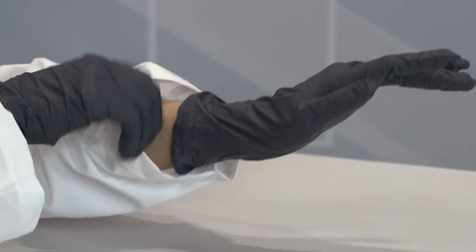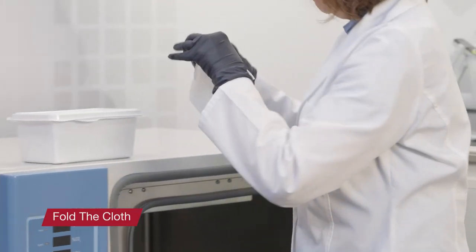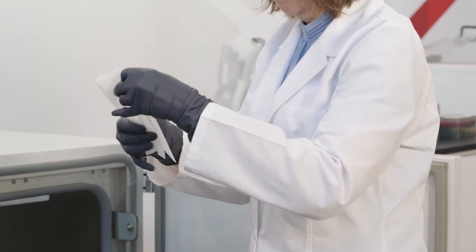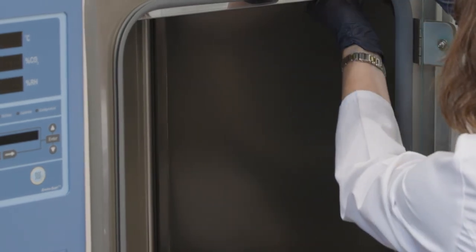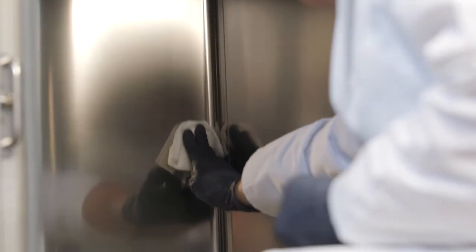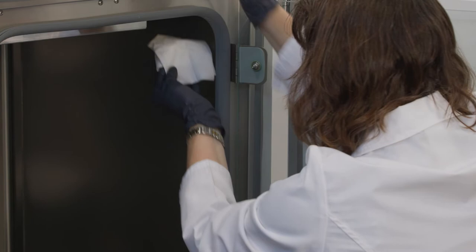Gloves and eye protection should always be worn when handling chemical disinfectants. In midair, fold the cloth in half, then fold in half again so it is folded in quarters. Hold the folded cloth between thumb and forefingers so that the fold is toward the surface to be cleaned and the edges are facing the palm of the hand. There are many different types of surface cleaners with different compositions and concentrations. The level of risk varies with the chemical and concentration, but in every case, it is important to check the safety data sheet and manufacturer's recommendations for use.